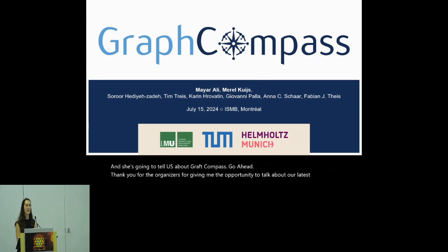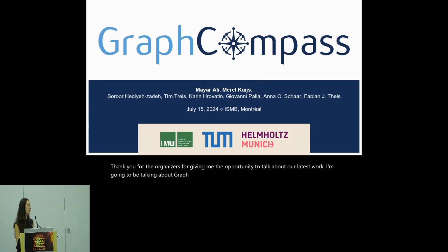I'm going to be talking about GraphCompass, which is our computational toolbox for comparing cell spatial organization. Let me maybe clear up a possible misunderstanding straight away. We just received a really wonderful talk about the organization of subcellular structures in cells. And now I'm going to be talking about how those cells organize to form tissues.